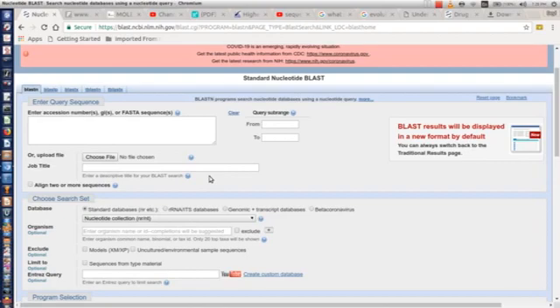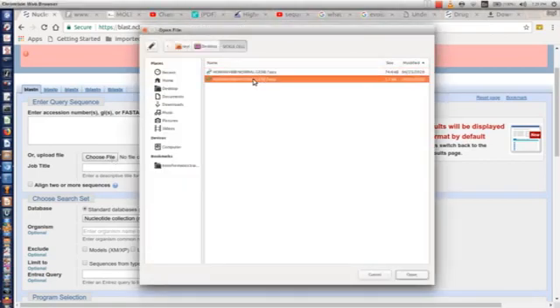Now what you need to do is choose the file, because it's already on your system: the hemoglobin mutant gene. Here's mine. In case you don't know where the folder is, just look for the folder, mine I named sickle cell. So human normal gene and human HBB mutant gene. We're actually working on the HBB mutant gene. We want to look at variations, we want to understand differences. We want to work on multiple sequence alignment of this mutant gene and do phylogenetic analysis.